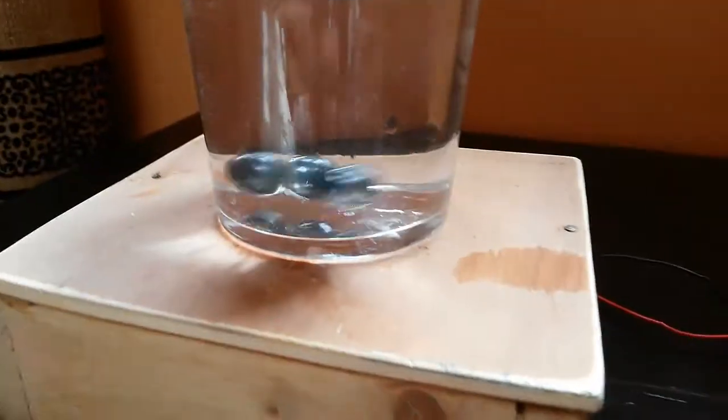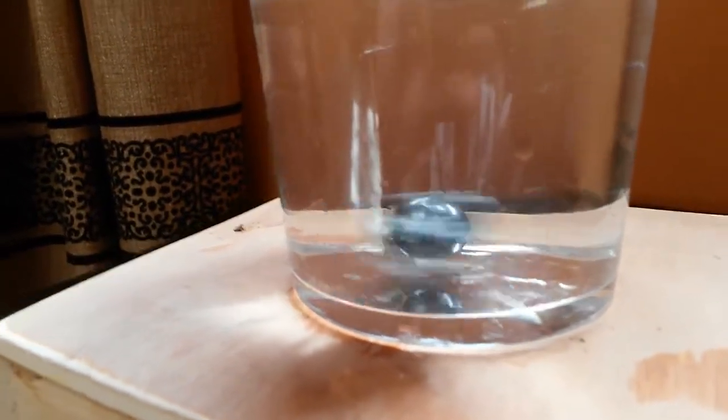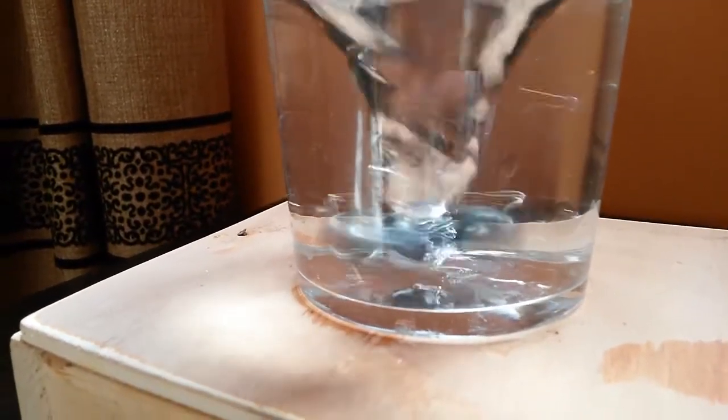I'm going to plug in the adapter. As you can see, the stirrer is starting to move the water. It's a variable output so I can control the speed as well. This is medium speed — I'm not going to go higher as I risk the stirrer colliding with the walls of the glass and potentially breaking it.